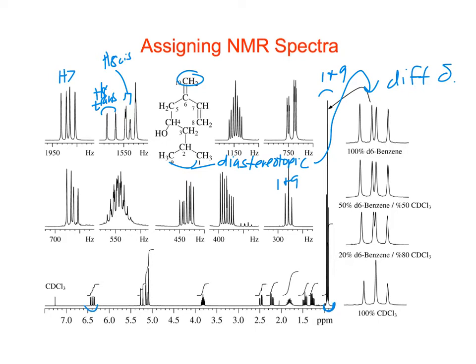So I'm not 100% sure here whether, let's see, look at that one next to the H8. I think this is one of them. Yeah, this is one of the H10s. And then I think probably the other H10 might be overlapped right here. So H8 is here, H10 is on top of that, and the other H10 is over here. That's my guess.